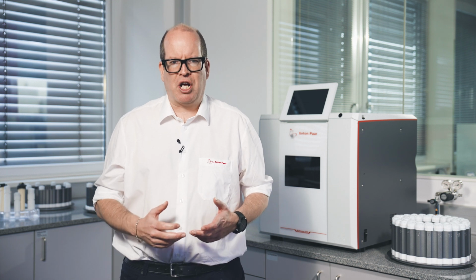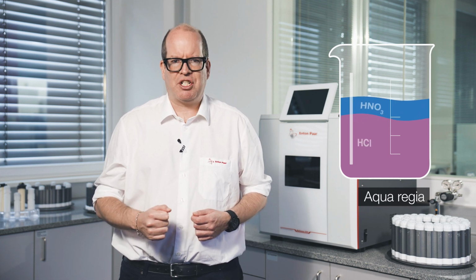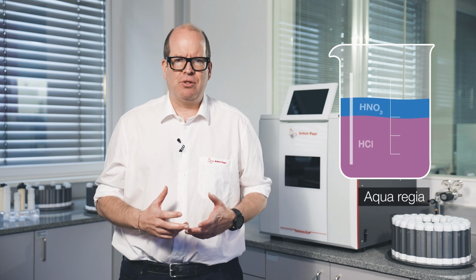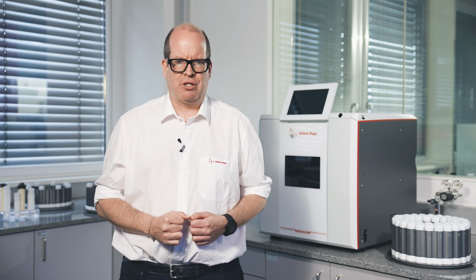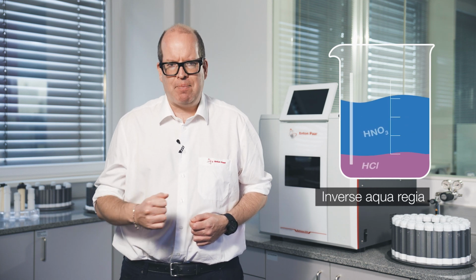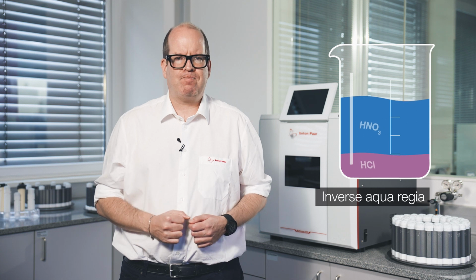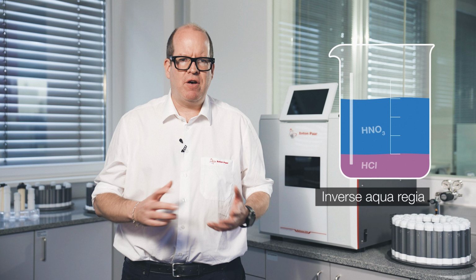The most common ones are aqua regia. A mixture of 3 parts of hydrochloric acid and 1 part of nitric acid is called aqua regia and is used to digest alloys or some noble metals like gold or platinum, although it can't digest all noble metals. Inverse aqua regia corresponds to a mixture of 1 part hydrochloric and 3 parts nitric acid and is less corrosive to the instrument equipment. For many applications, aqua regia can be replaced by reverse aqua regia.